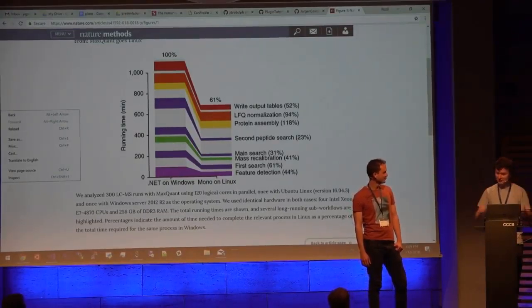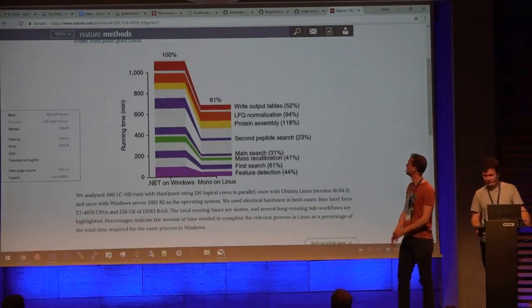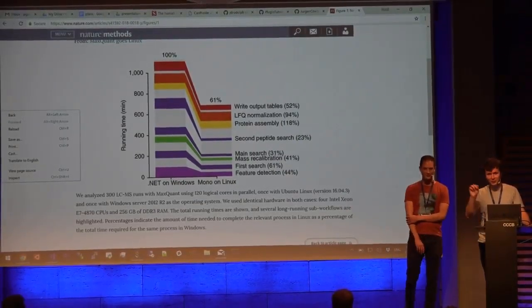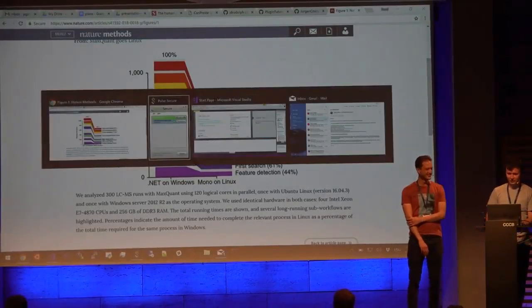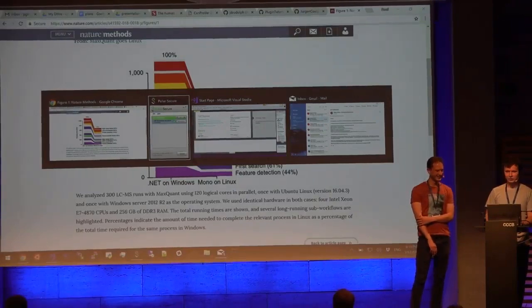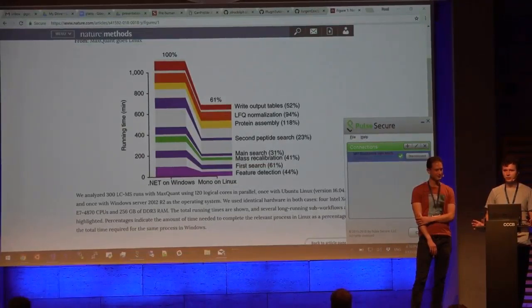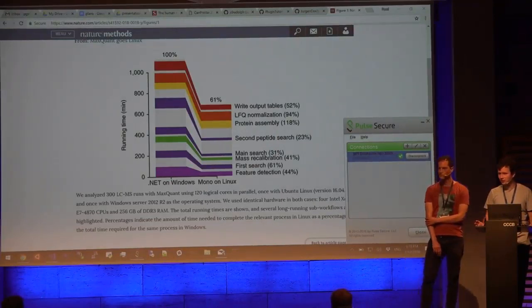But first of all, I want to start not from plugin programming. I want to use the moment because I guess many of the people who stay here were not afraid of the programming word in the title. So I think it would be really cool to demonstrate something we created not so long ago: how to run MaxQuant on Linux. For a long period of time, MaxQuant was running just on a Windows machine.